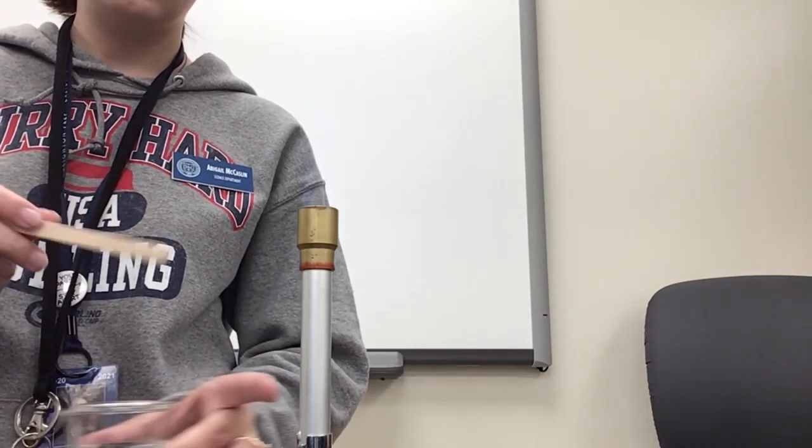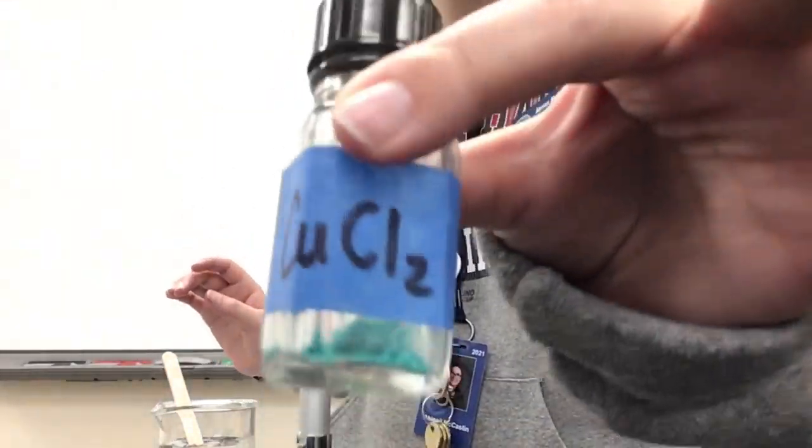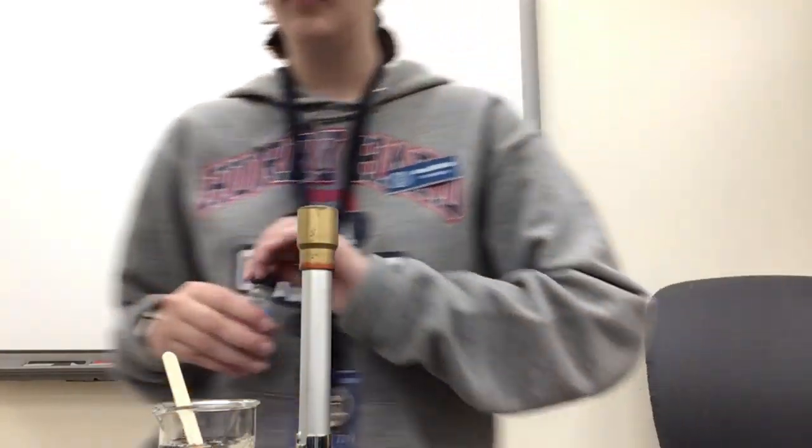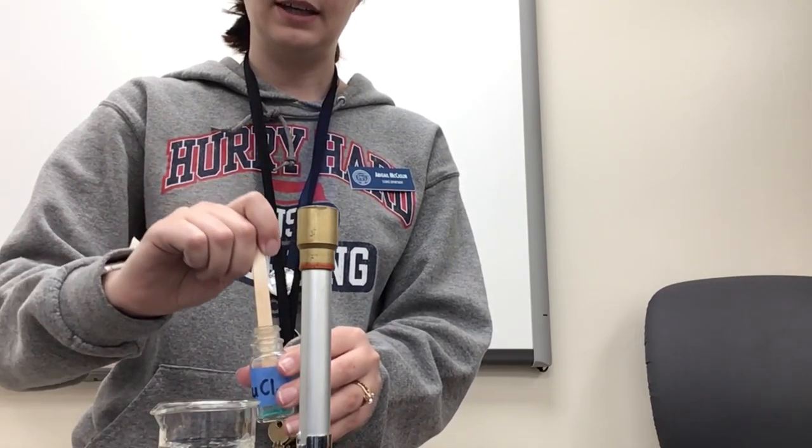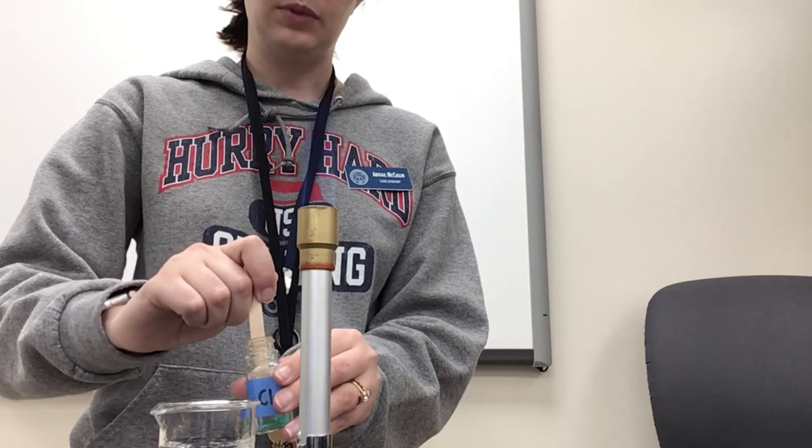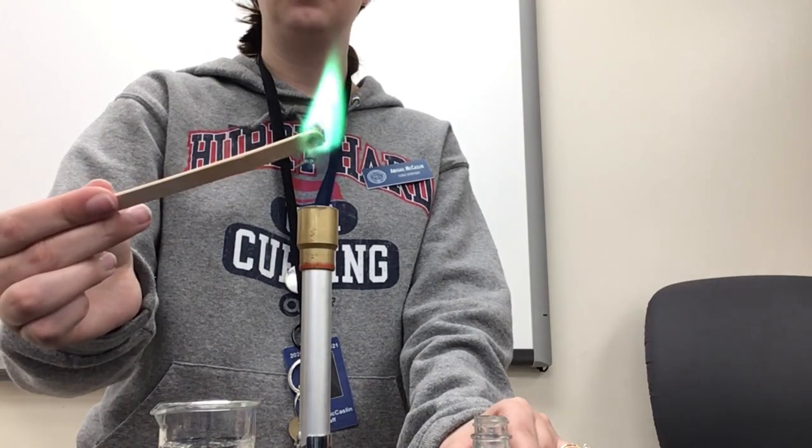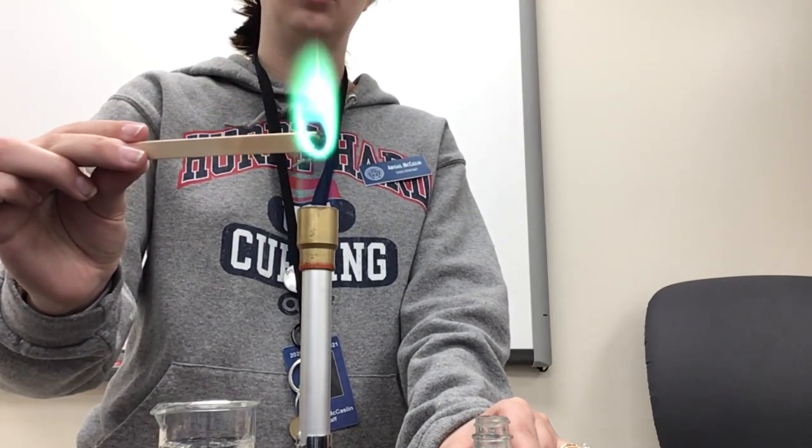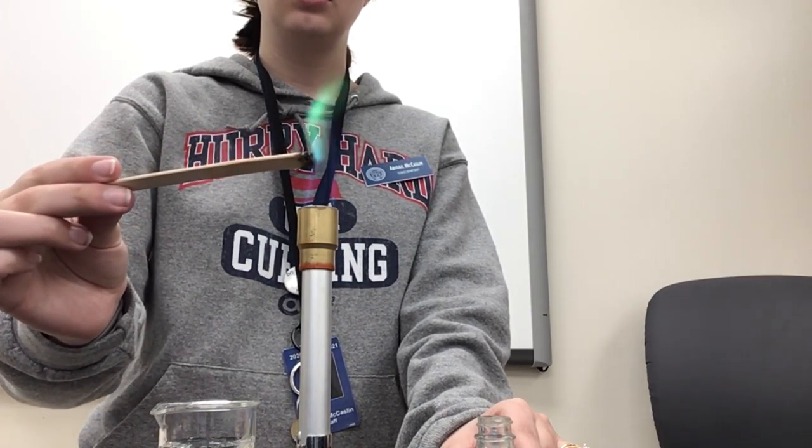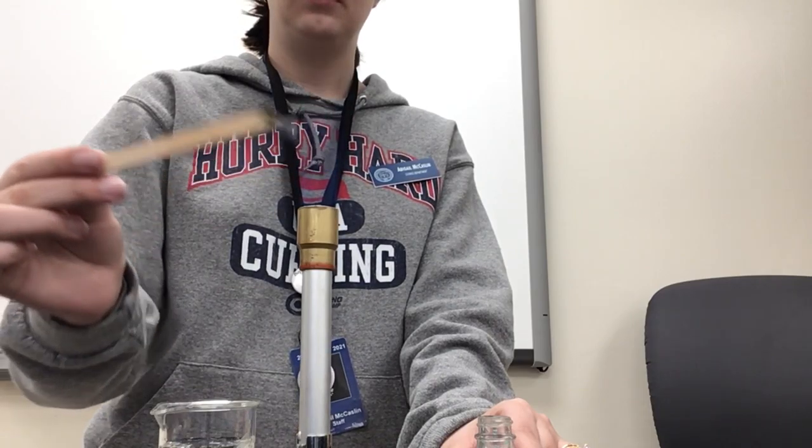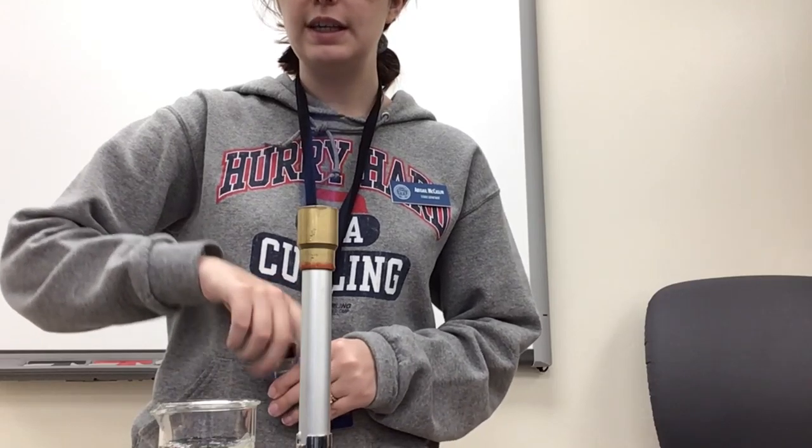So I put a wooden stick in a beaker of water and we are going to start with our CuCl2, it's our copper chloride. I open my cap, I take my damp popsicle stick, I dip it in. I do not scoop. I dip it in a couple times. There we go. I get my sample. And now here's the flame. Record the color of flame that you are observing. And I will dispose. That was our copper chloride, so our CuCl2.